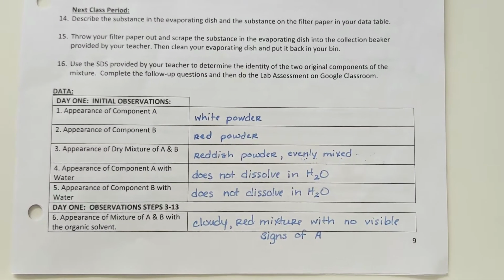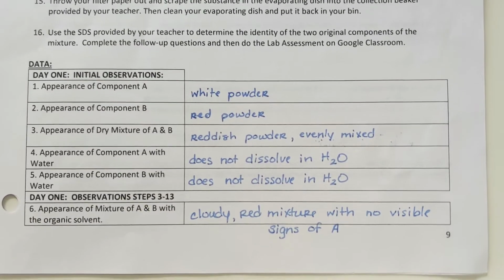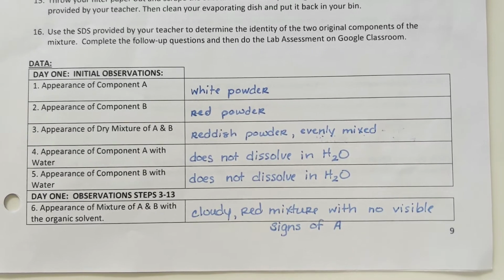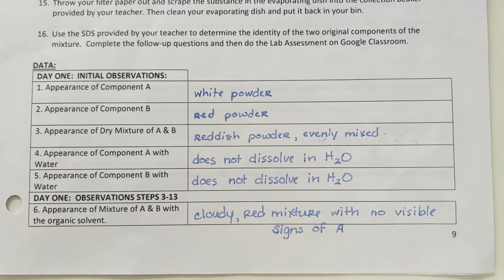This is the separating mixture lab that we did last week. The data that we should have taken for day 1 is shown here. We saw that A was a white powder and B was a red powder.